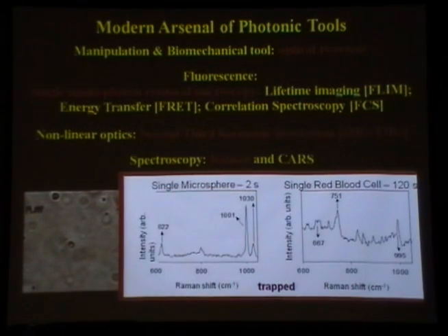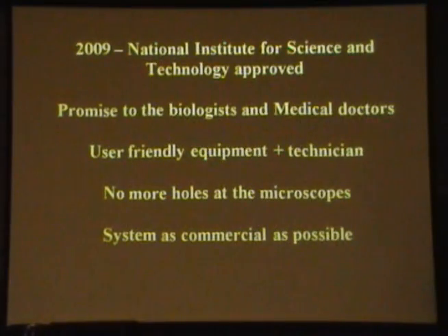Here, I don't know why it's not playing. That's a spermatozoid trapped in my optical tweezers. And we can take Raman spectra of any living microorganism right there at the focal spot of the optical tweezers.